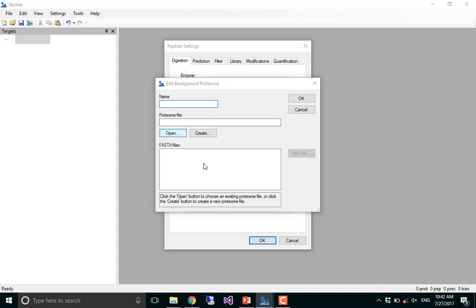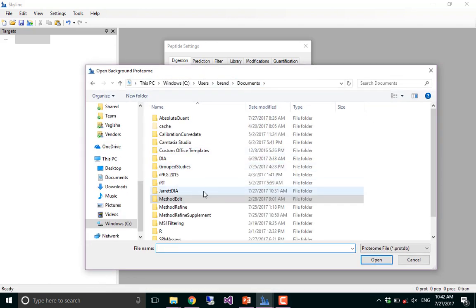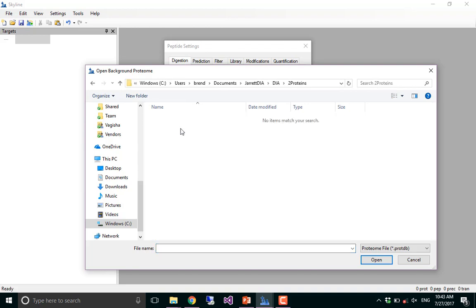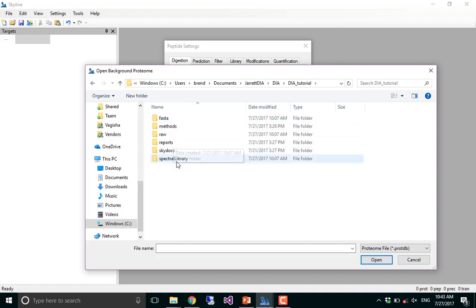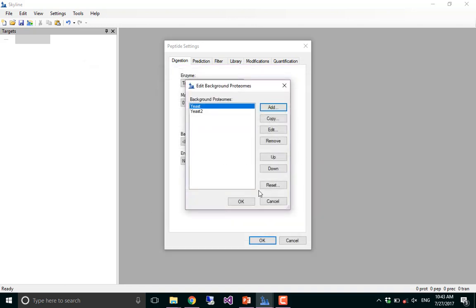Should already have one. Oh, I see. I need to generate one. Okay, I'll just use Brennan's because it'll be faster.